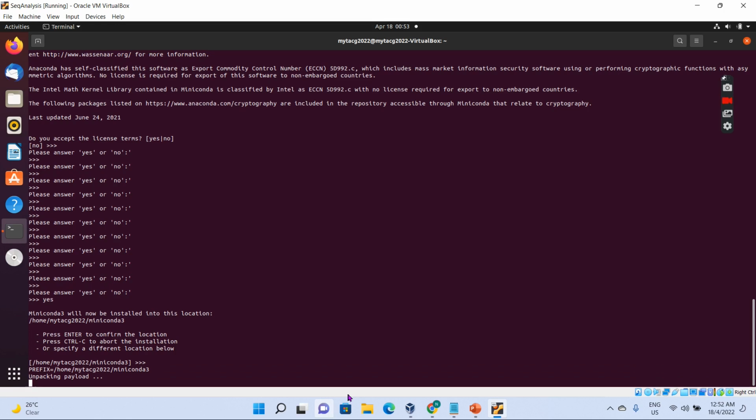I think this waiting time should be no more than 30 seconds. So we wait first. Now the installation script is loading the software.